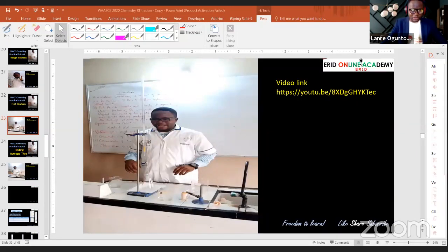Okay, that's brilliant, Sean. She said that you need to make sure you are reading from the lower meniscus. That is very key, very important. Make sure you are reading from the lower meniscus. That is very, very key and very, very important.